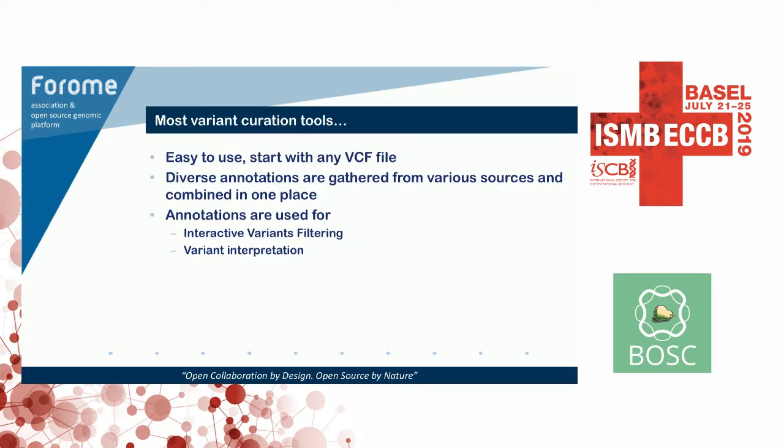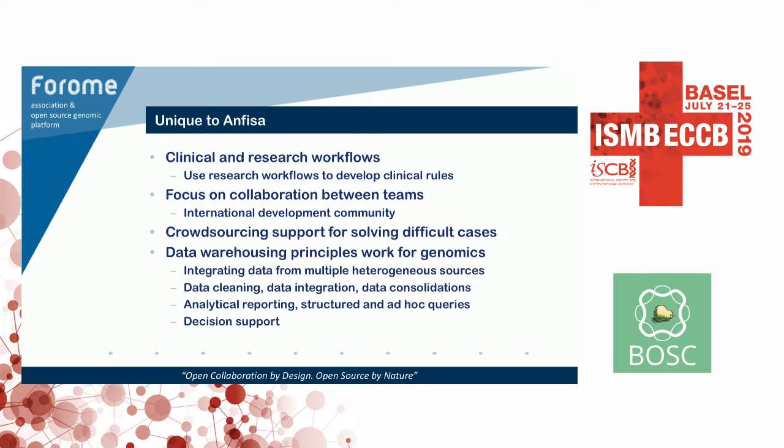Well, there are many variant curation tools out there, and I'm pretty sure that developers for all of them will tell you that the tools are easy to use, user-friendly, and use a lot of annotations coming from different sources for variant filtration and variant interpretation. But each tool has something unique to them, and I will talk a little bit about what is unique for Anfisa. First of all, Anfisa supports both clinical and research workflows.